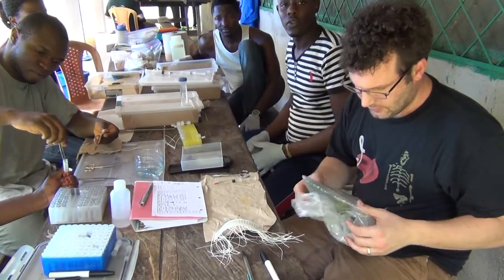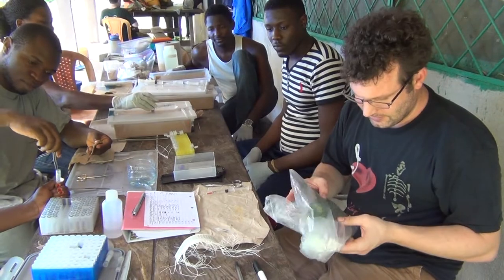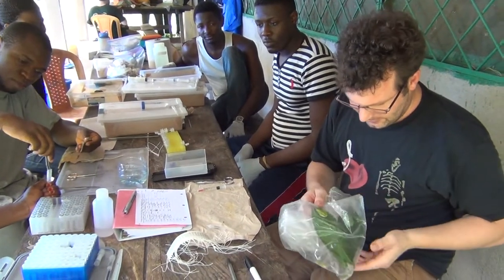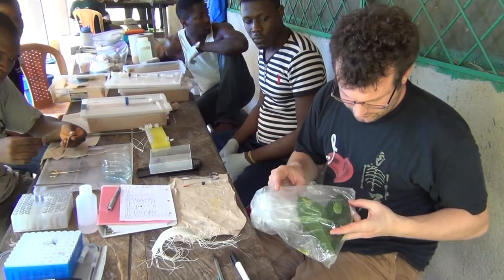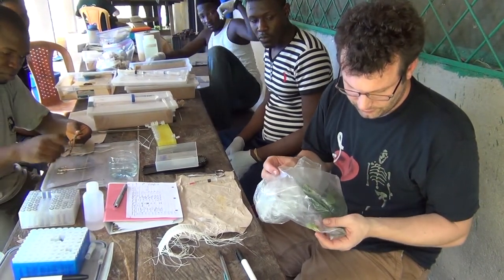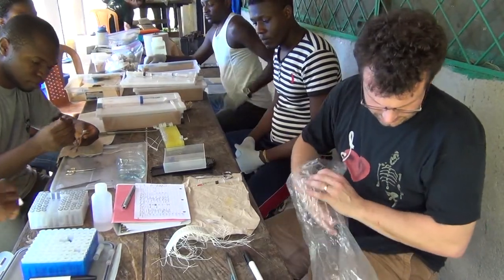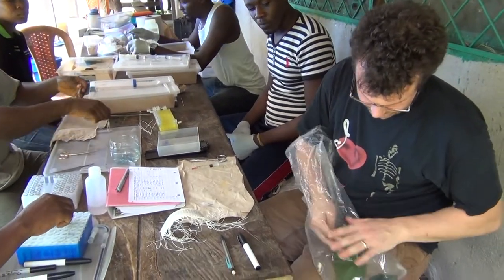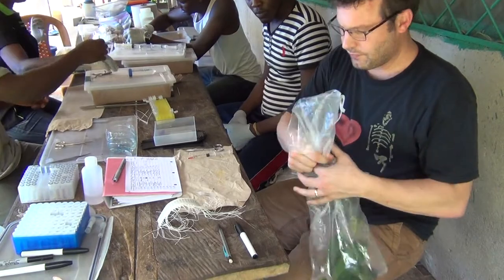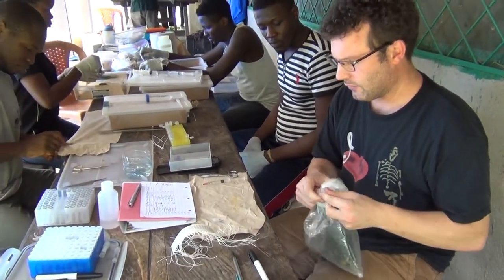We are going to go over preparing specimens. I have from last night a handful of specimens of Leptopelis brevirorostris, a forest tree frog, so we are going to start with one of these, and those will be the next ones that we prepare.